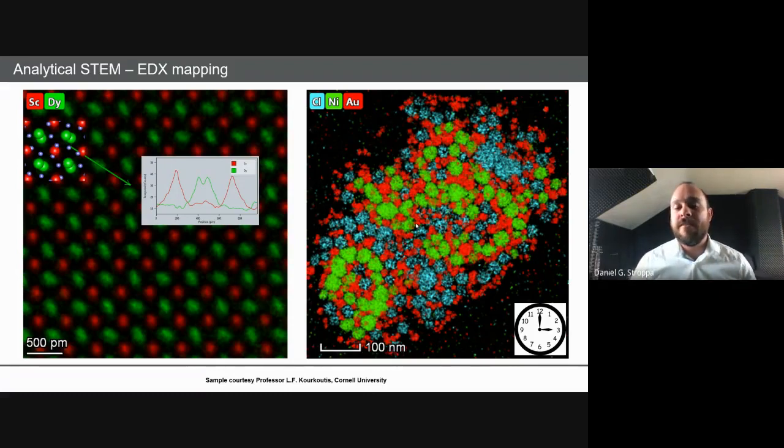And then I was trying to analyze this effect in the image. There are other ways to do this with holography, so that you have interference effects to try to measure. But so far, and this is where I stopped my research area, and I've been following because this is what I was researching, it's not possible to count single atoms with this approach.